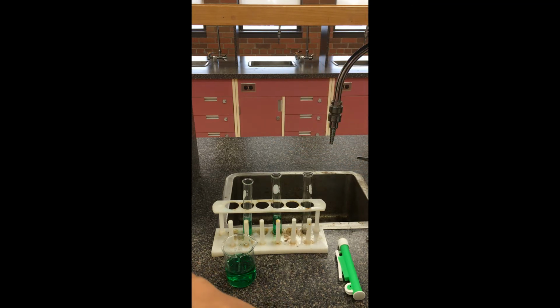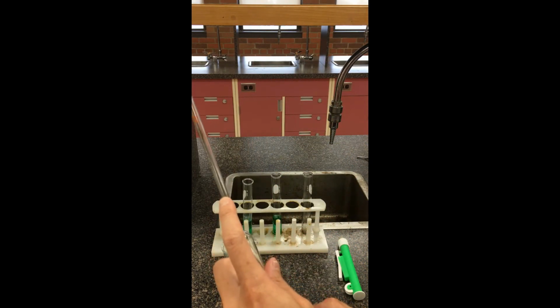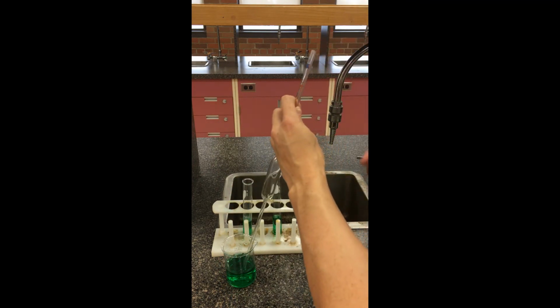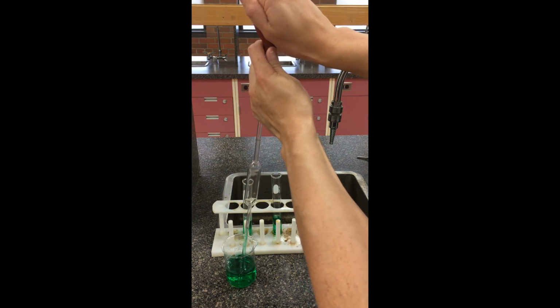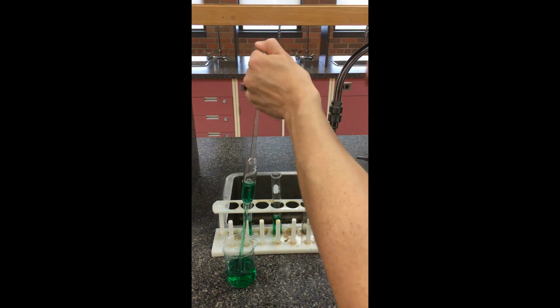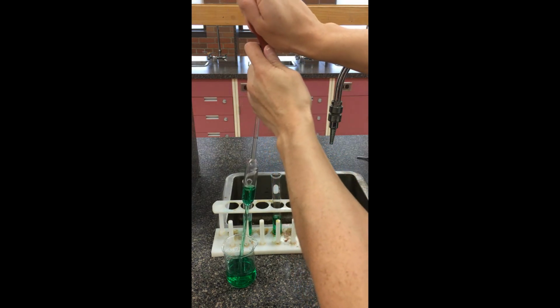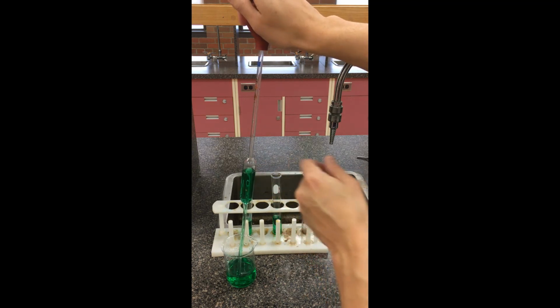So with our 25 milliliter pipette here, you'll notice the bulb is quite a bit bigger. Again, there is a line that calibrates for 25.00. Again, you're going to hold the open end underneath. You're going to use the suction bulb. You're going to find even after you soak up the first solution, the bulb here is almost completely released, but I haven't fully sucked up 25 milliliters yet. What you can do is put your finger on top, form a tight seal right now, give the bulb that squeeze again, and as you have that seal, gradually let it go until we're actually up to that mark again.